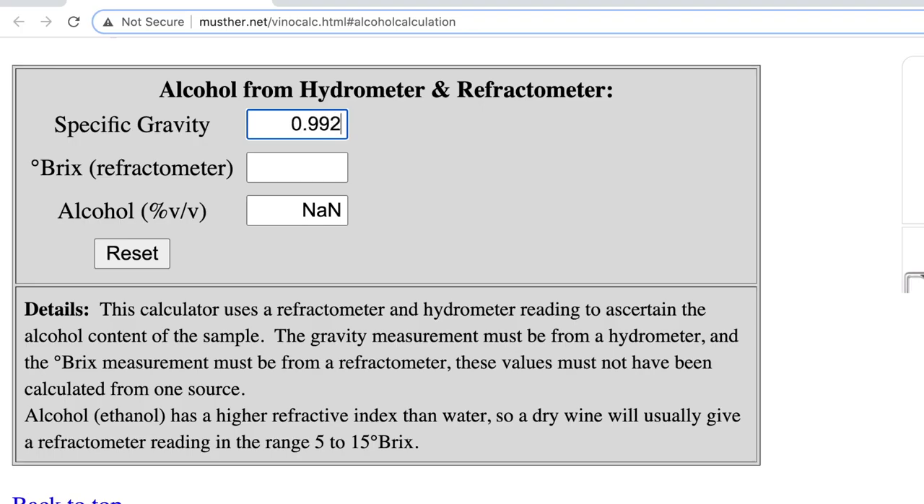Now let's calculate the ABV. Entering 0.992 for the density and 6.9 for the Brix gives an alcohol by volume of 12.7% — that's within the range. But remember, by the calibration the Brix could be reading a bit high, so maybe it's 6.7 or even 6.6. At 6.6 Brix that gives 12.2% alcohol by volume, which is still within the range.